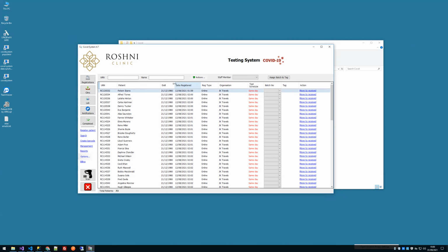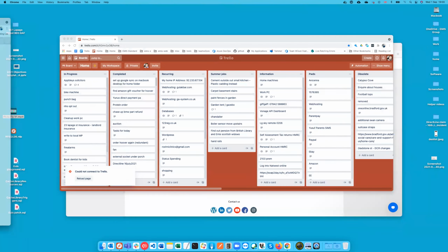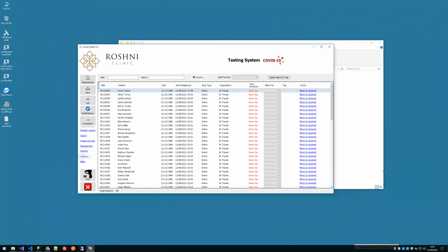Audit trails, day 2, day 8. Let me see if I can show you. I think I've got to open this one, haven't I? Is it this one? No, let's close that one off. Let's have a look. Projects. Yeah, there are a number of changes coming in that are being worked on at the moment, especially for the day 2, day 8, which is quite crucial.